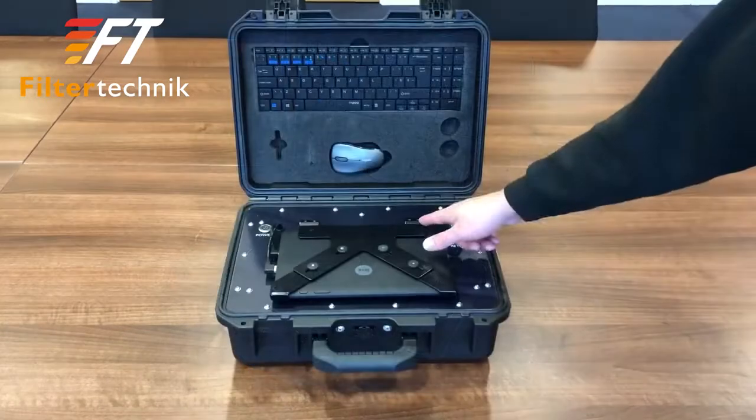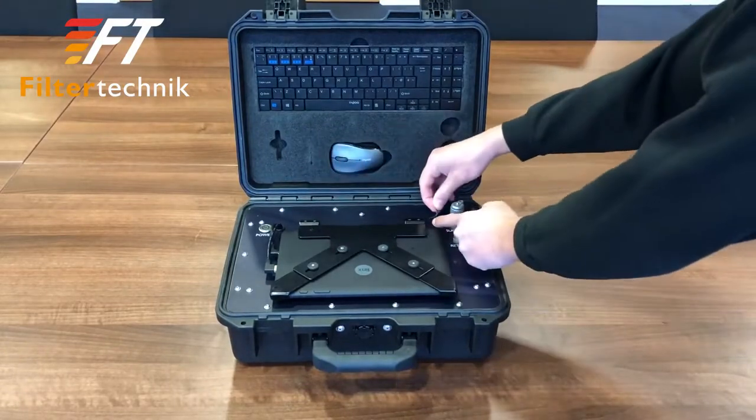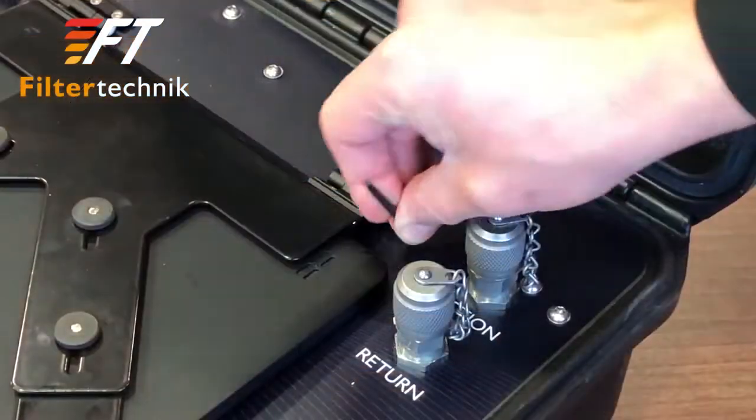Here we have the hinges on the back of the tablet. The allen key is used to adjust the tablet's hinges if for whatever reason this loosens.